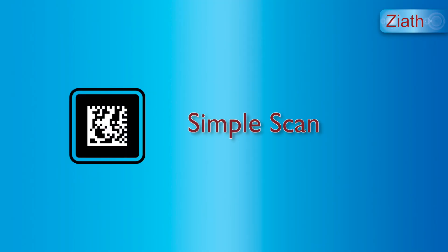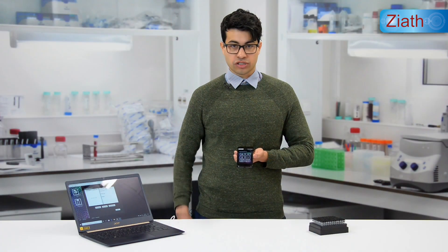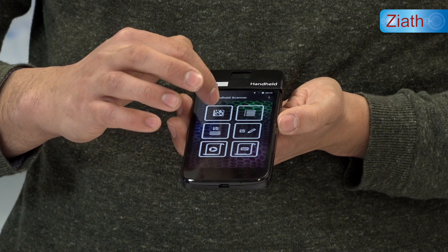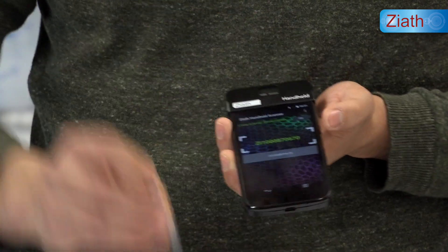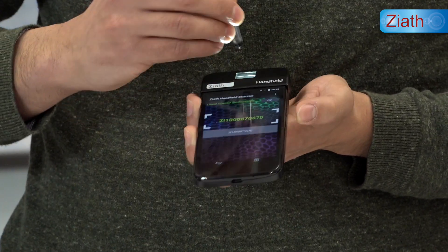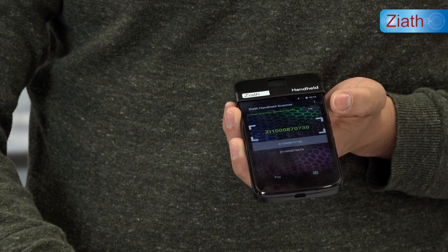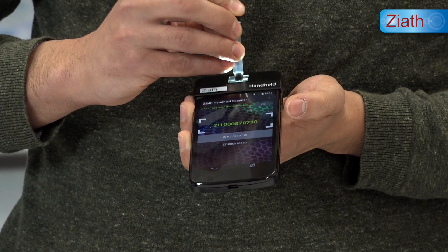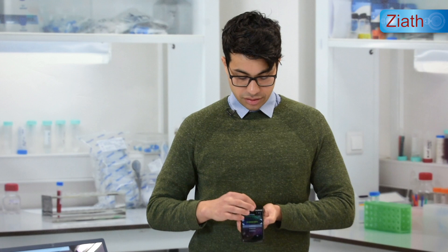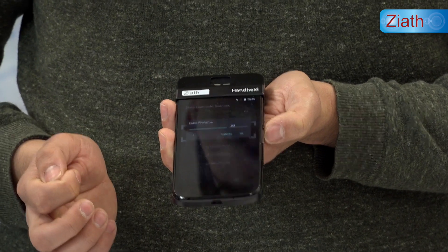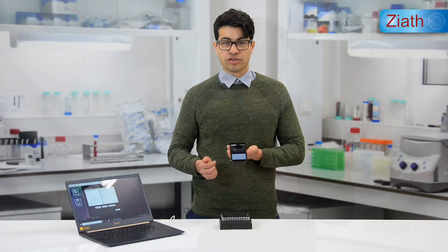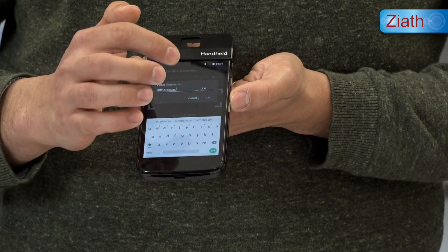I will now show you each individual feature of the handheld. To begin with, for the simple scan function, I open up the application and scan a series of tubes and one final one. I can then take this scan list, save it on the handheld, give it a name — I'm going to create a file here called simple scan — and press OK. That file is now saved onto the handheld.